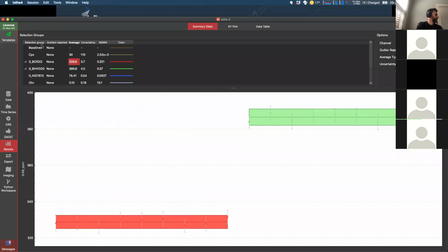Then it also gives us a little bit of a feel about our uncertainty. So you can think of this as stepping up further into the levels of abstraction. We start off by looking at every single individual data point. Then we start looking at the results for each individual selection. And then we start looking at the results for groups of selections up here. So it's stepping up the chain further and further up.